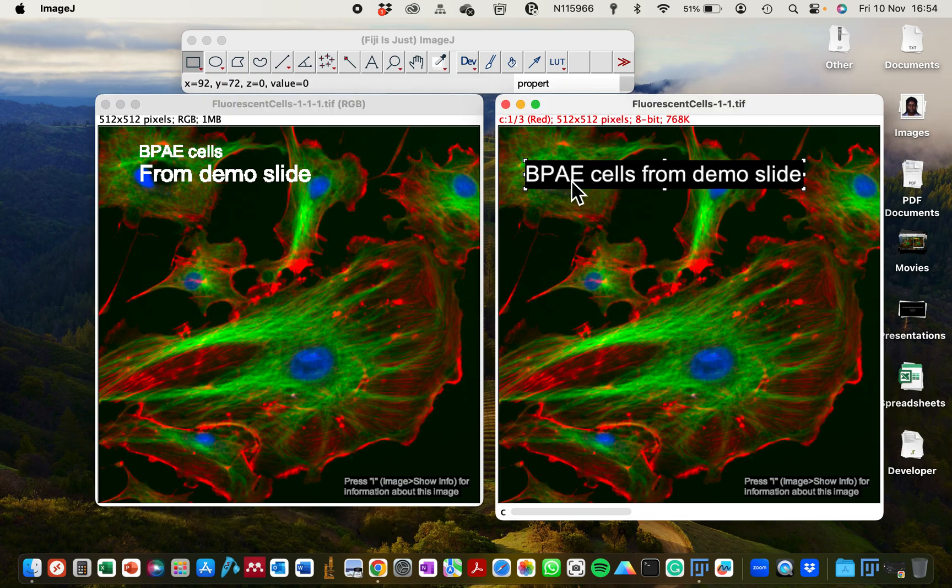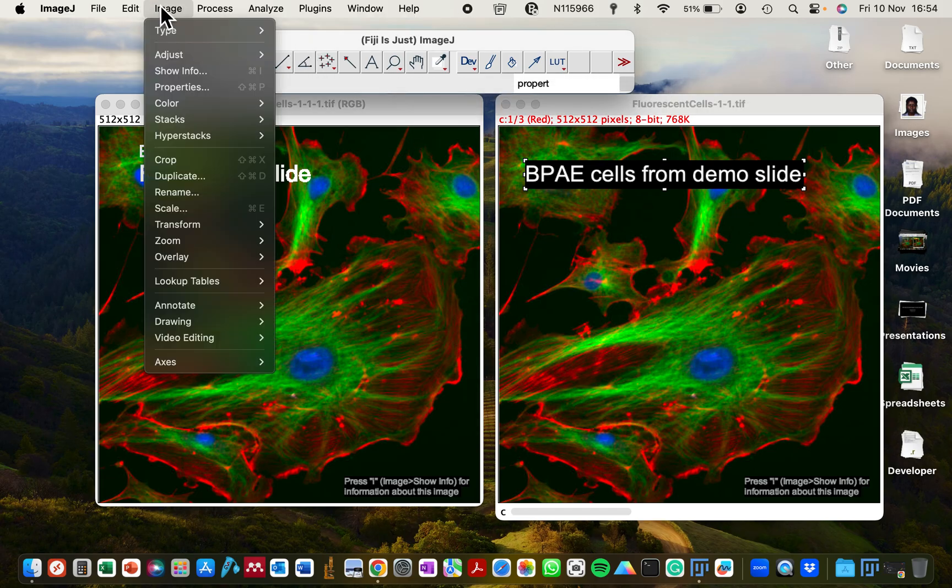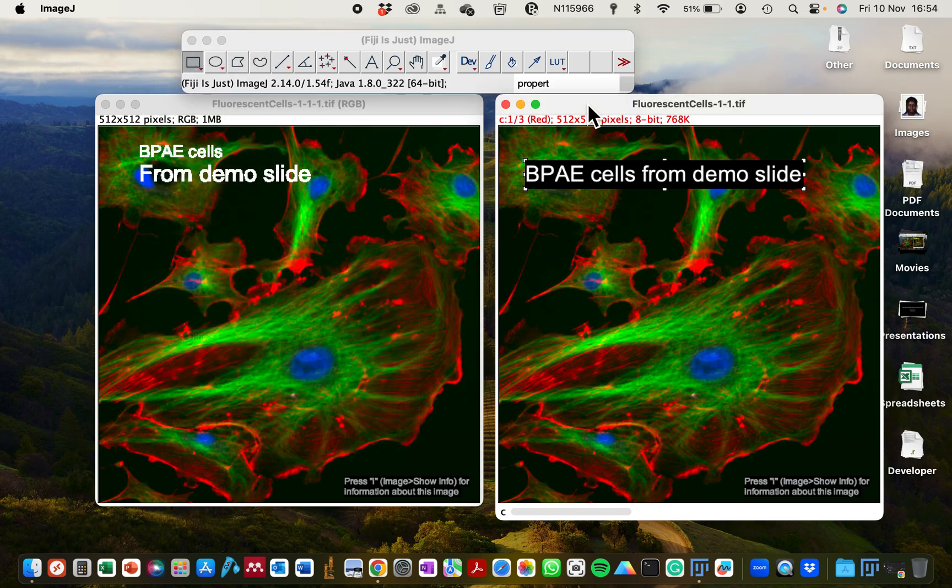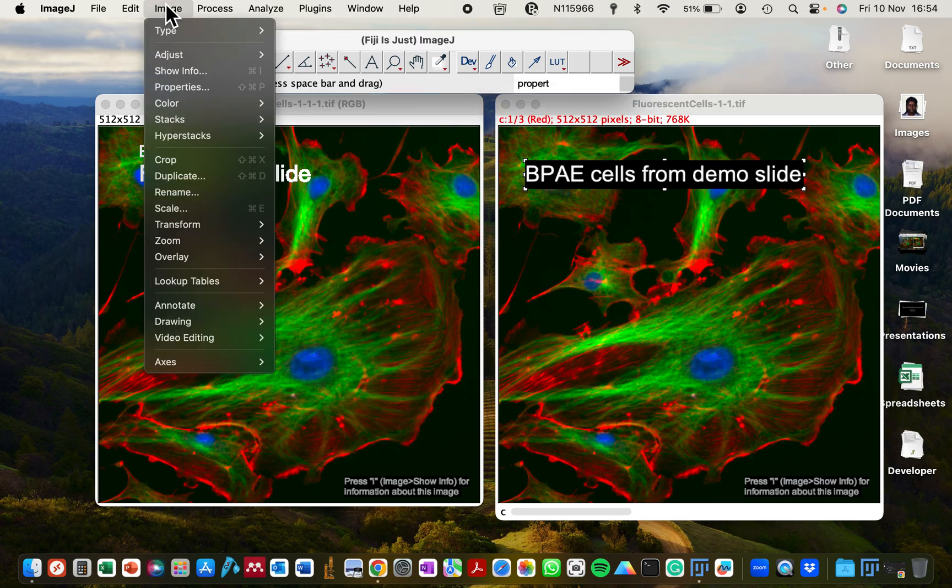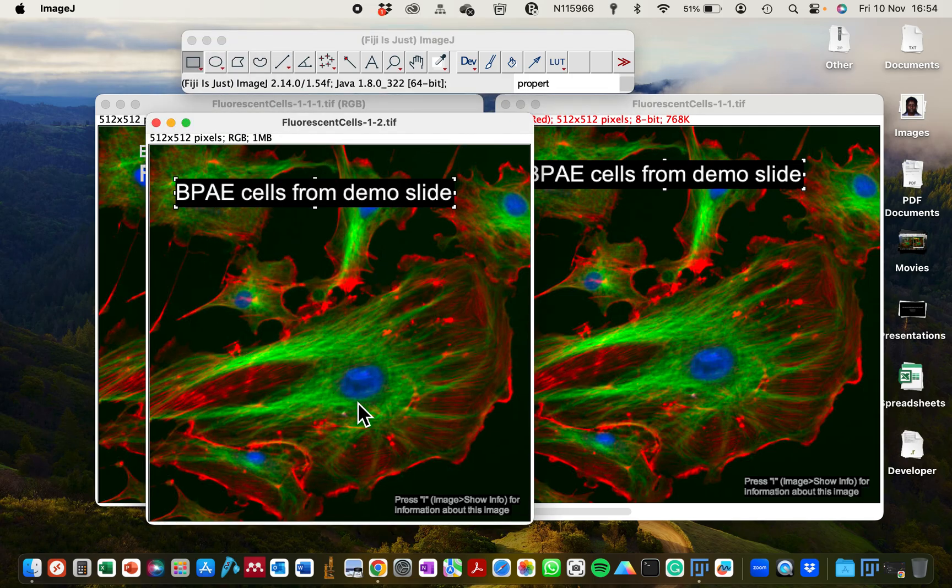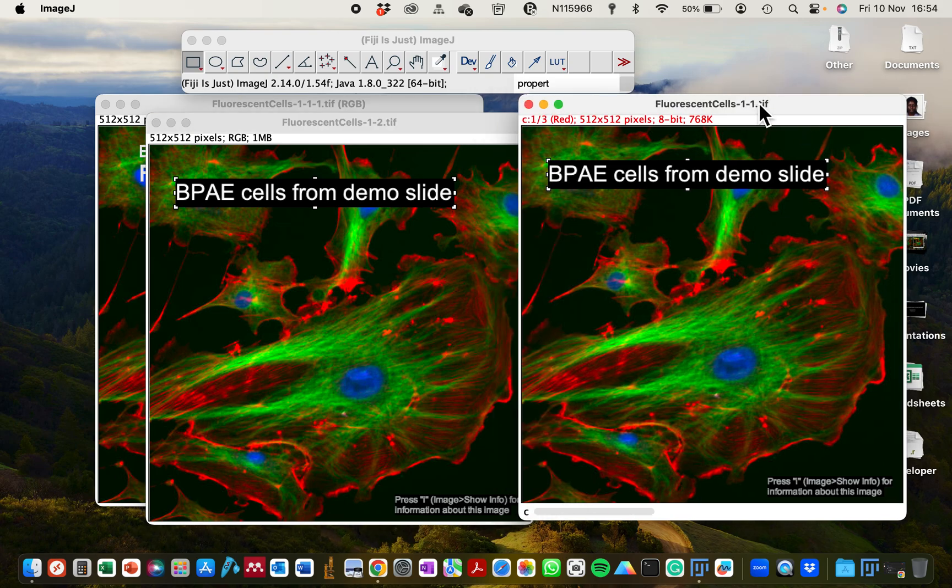So that is why I want to show you how to make sure this text stays on the microscope image. So what I'm going to do next is to go to Image, go to Overlay, and first let me ensure I'm working with this image. Go to Image, click on Overlay, and click on Flatten. This will generate a new image, and this new image now has our annotated text with the background on it.